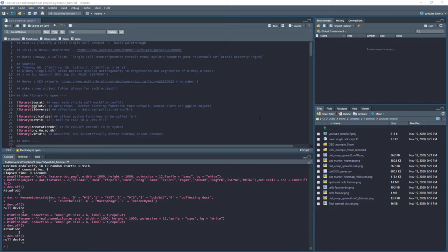We're not going to fiddle too much with the dials or any of the settings, and I'll touch on essentially what we're doing. At the end of this, the idea is that you'll have created some clustered, QC'd single cell data that you have annotated and classified somewhat.